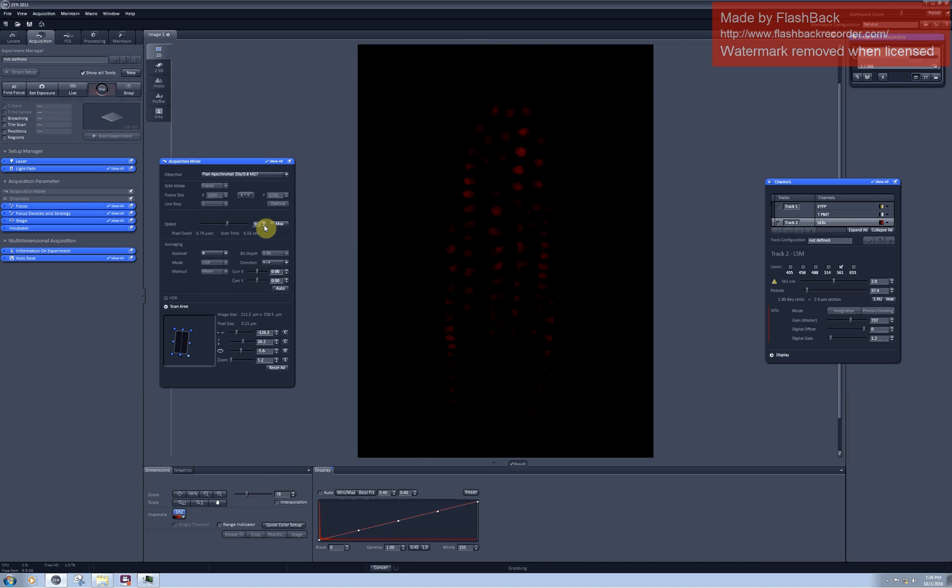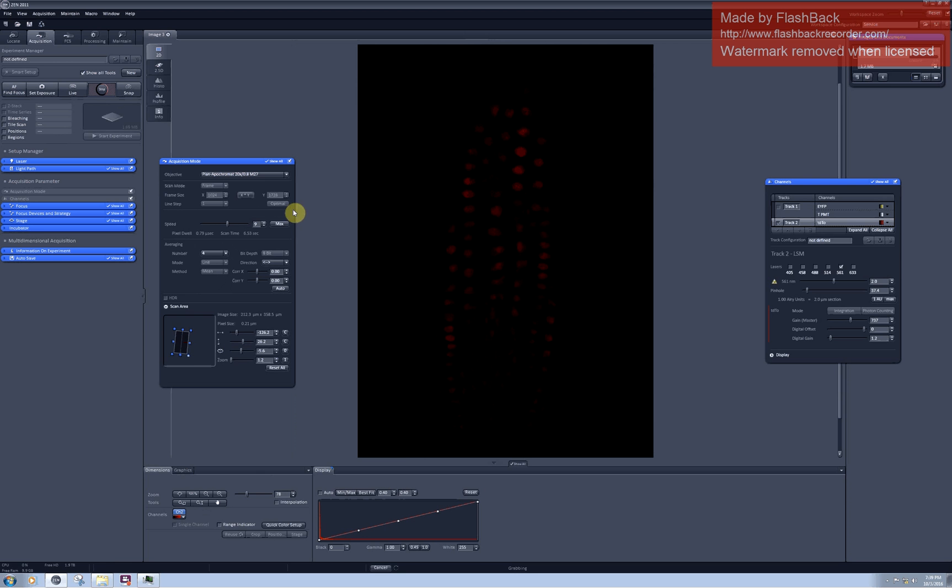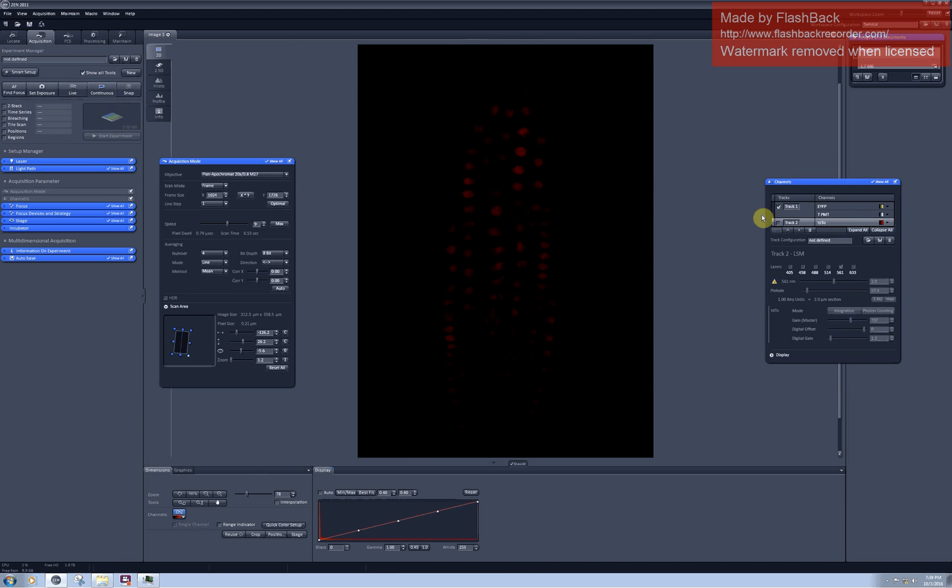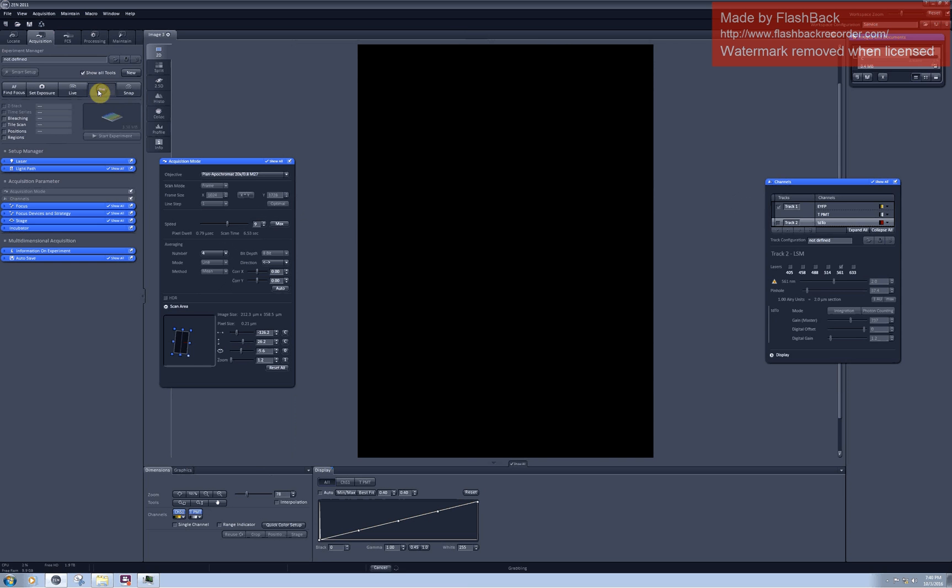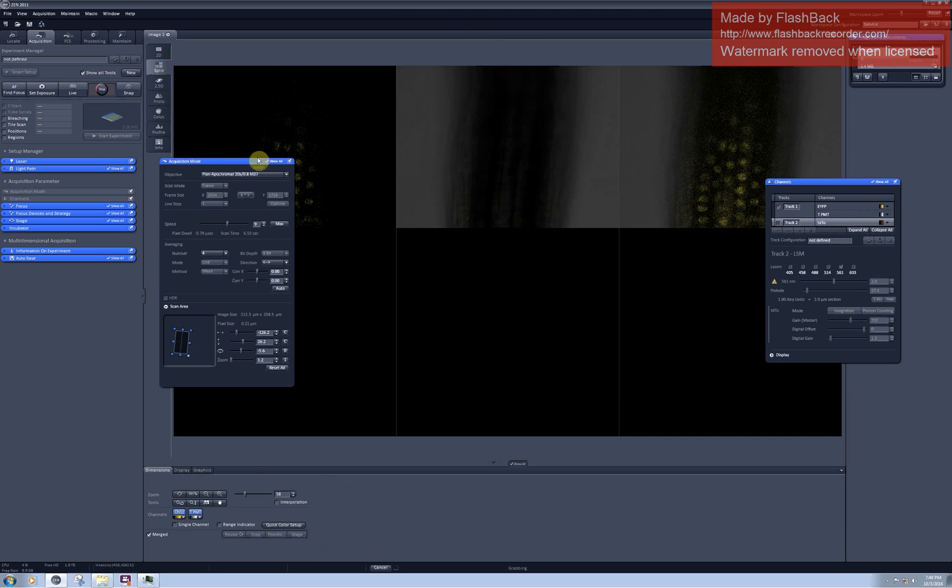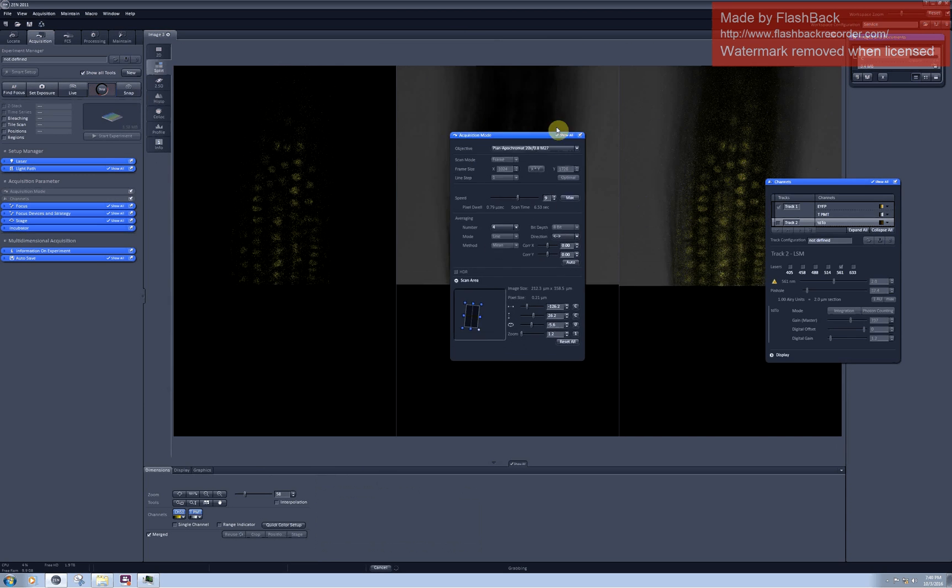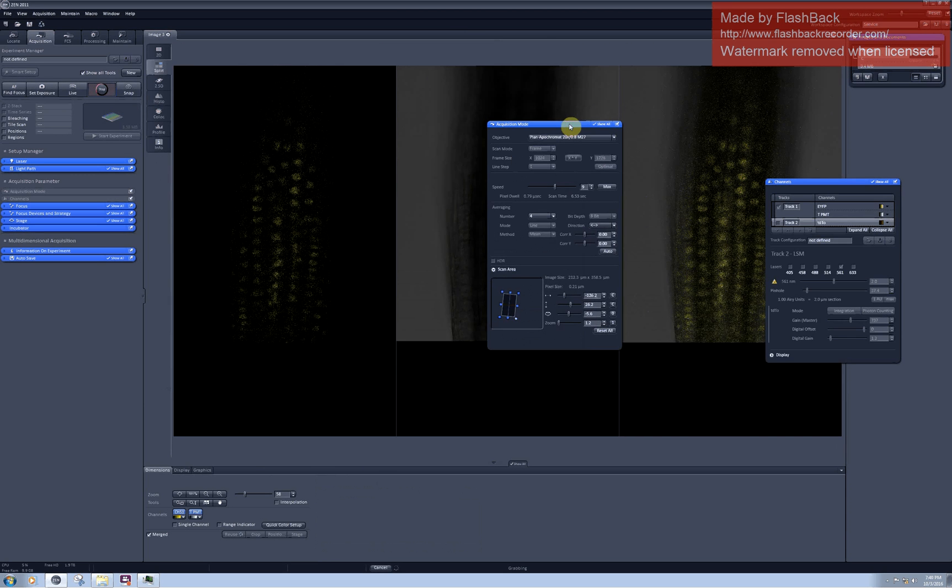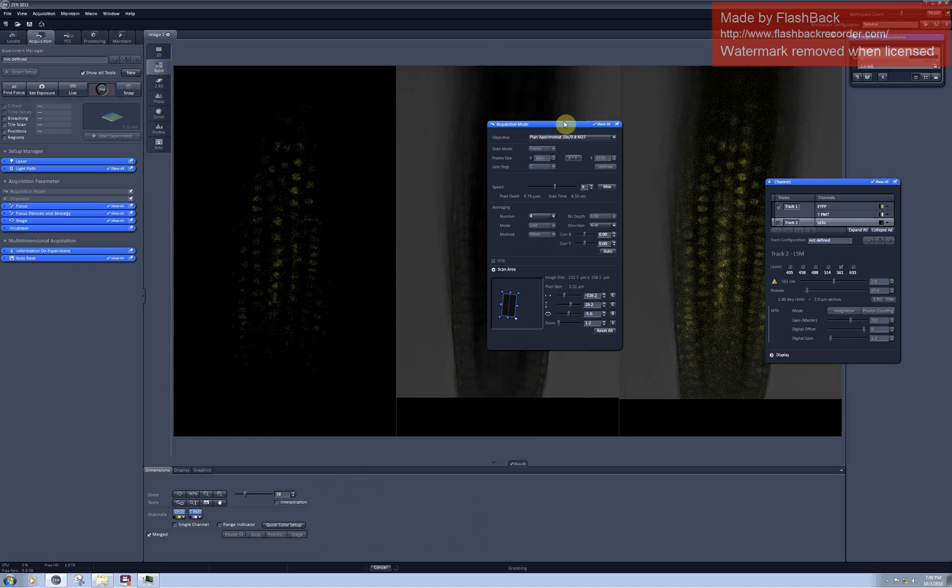Or I can combine slightly lower speed with slightly higher averaging and see if it gives me a good result. And you would probably like to have good quality scanning in both tracks, so you can check what it looks like in another track. And it's not so rosy here.